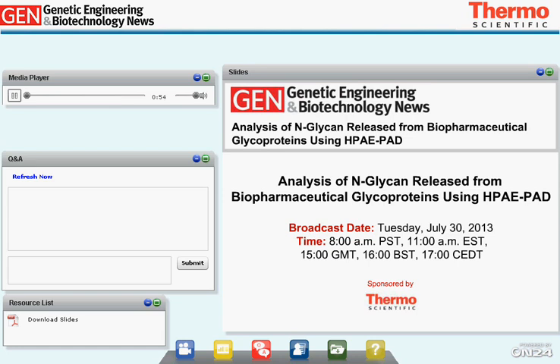That's what today's webinar has been designed to address. Our panelists are going to discuss how a specific technique, HPAE-PAD, can be used to perform accurate and consistent mapping of N-glycans from biopharmaceuticals. Let's meet our panel.